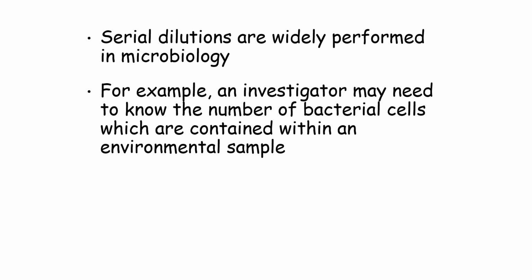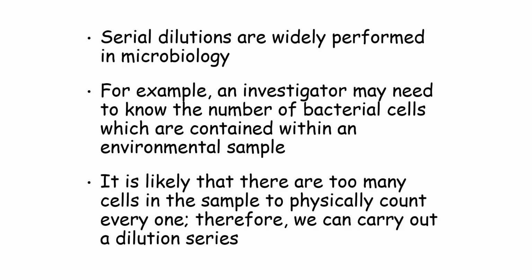Now, these dilutions are mainly used in microbiology because you would have cultured your cells in a culture medium with serum, with growth factors, your vitamins, your nutrients in there, and trying to grow a large number of cells. However, when you want to count the cells, you need to dilute that cell culture until you've got a countable number.